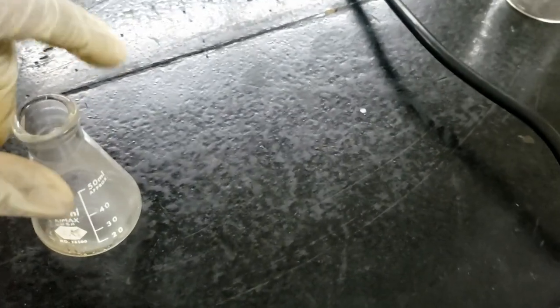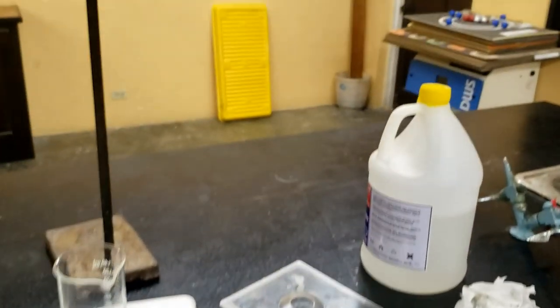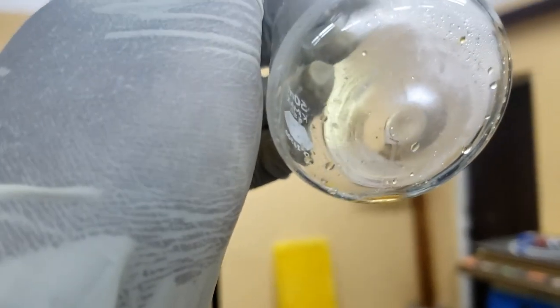After we've evaporated off the eluent from fractions 10 to about 15, so we did quite a few fractions, we happened to get back the oil that we expected. So that oil that we have here should be pure o-bromonitrobenzene.